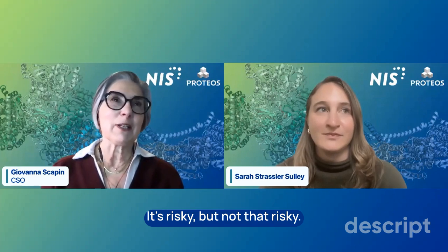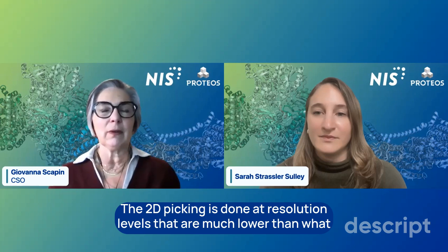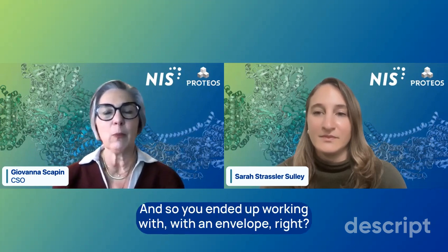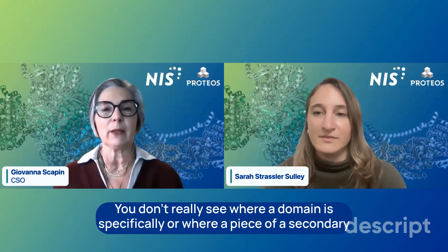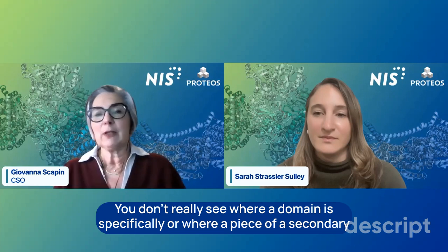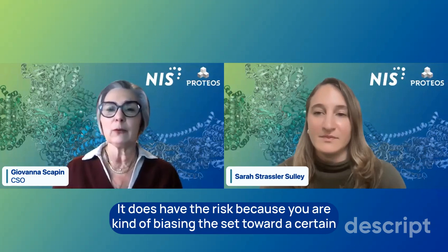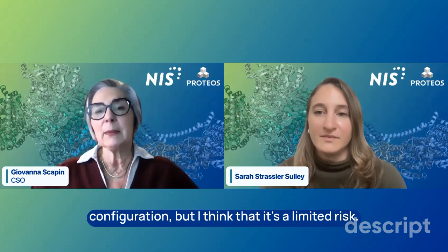It's risky, but not that risky. The 2D picking is done at resolution levels that are much lower than what we think about as atomic resolution. And so you end up working with an envelope, right? You don't really see where a domain is specifically or where a piece of a secondary structure goes. It does have the risk because you are kind of biasing the set toward a certain configuration, but I think that it's a limited risk.